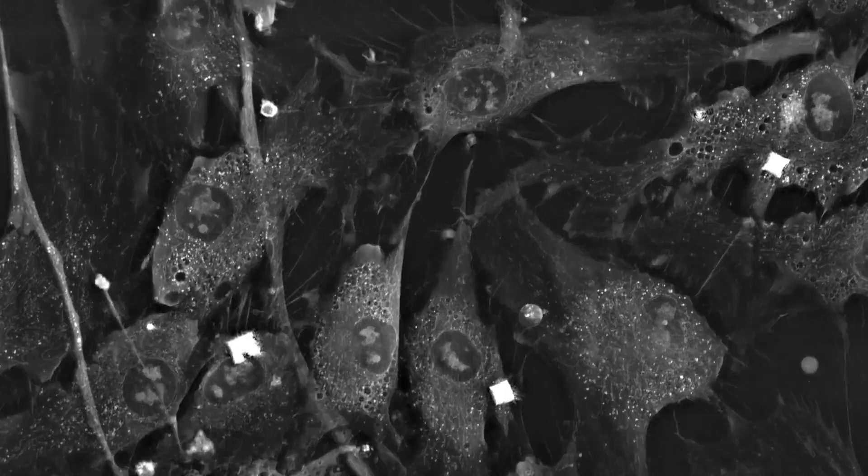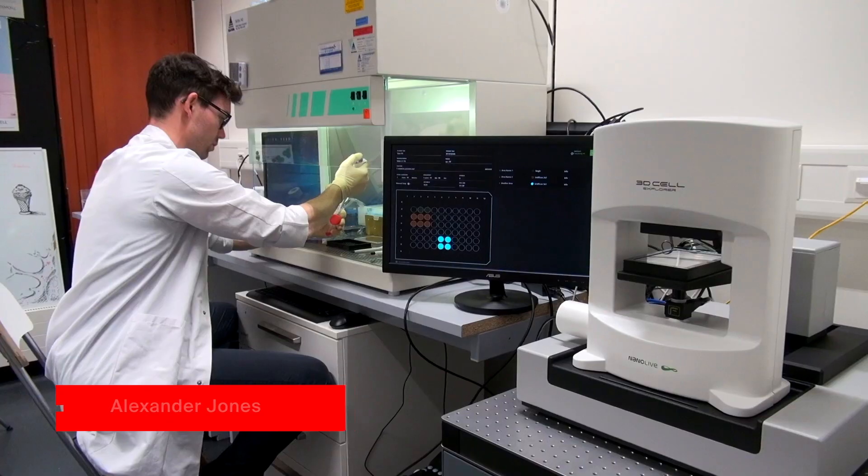The CXA from Nanolive is a holotomographic microscope that is fully automated and allows researchers to interrogate living cells as never before.